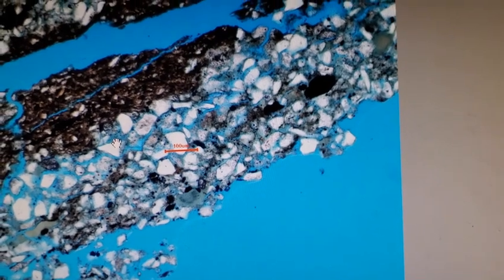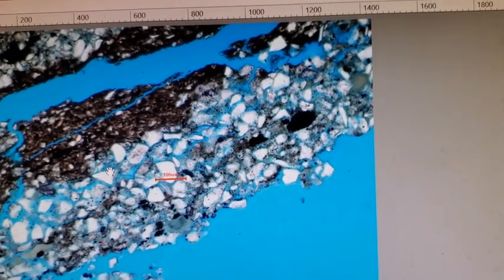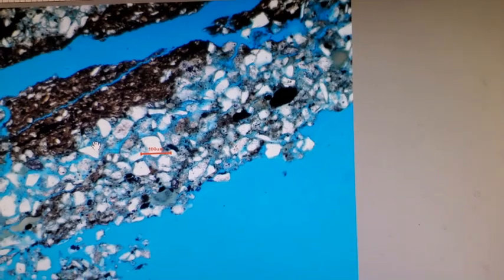And as I said, many of what people often call sand in the Viking is less than 100 microns in size. It is, in fact, a silt. And that is one of the things you learn here when you look through the microscope at the Viking siltstones. That is a reservoir you're looking at. That's where you can produce oil and gas from. Well, welcome to the world of petroleum geology.